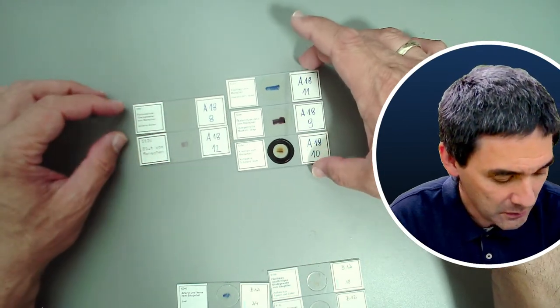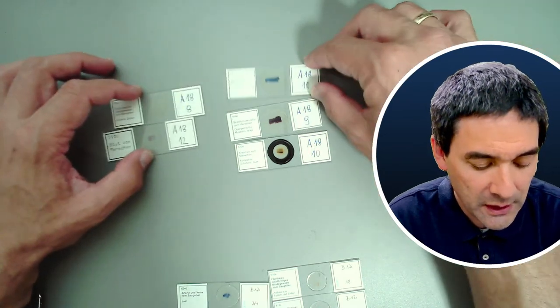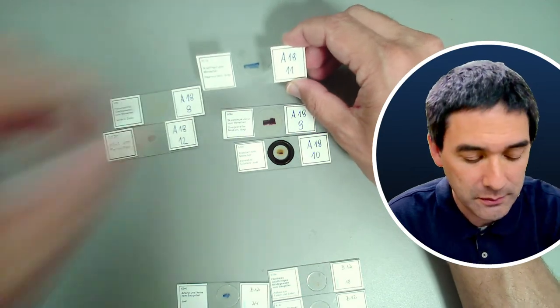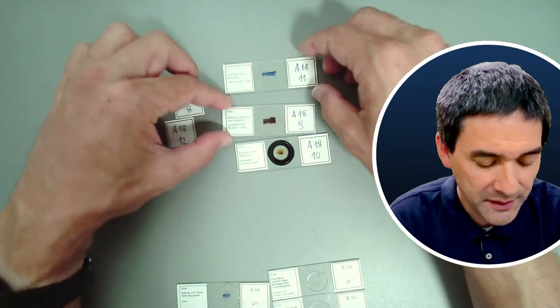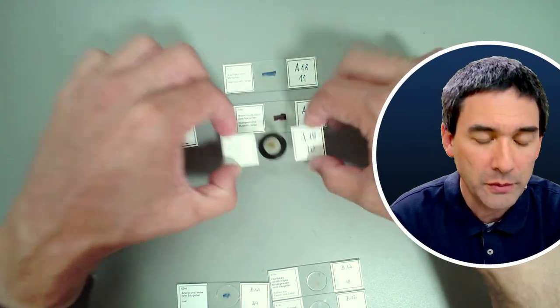So that is epithelium over here, blood from the human body. This is the head, skin, scalp, with some hair. This is muscle, skeletal muscle of a human being, and it's bone of a human being.